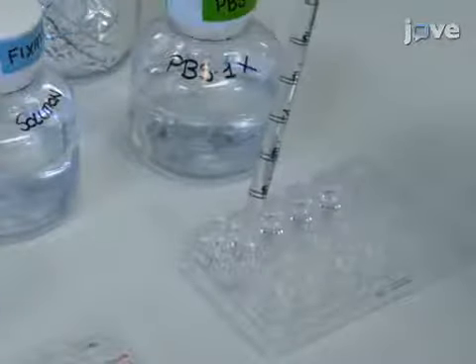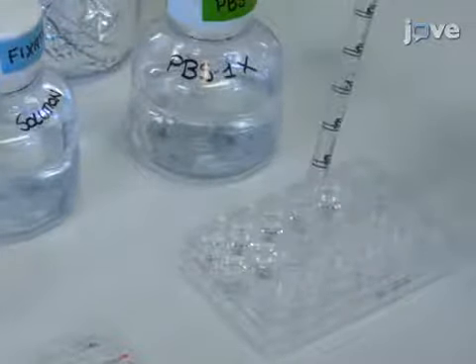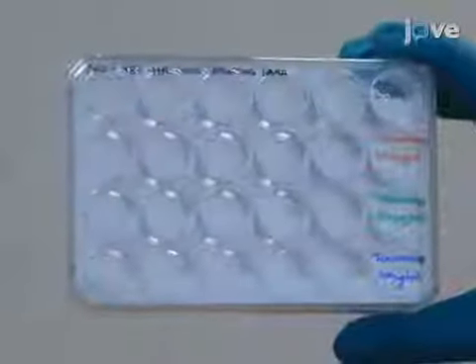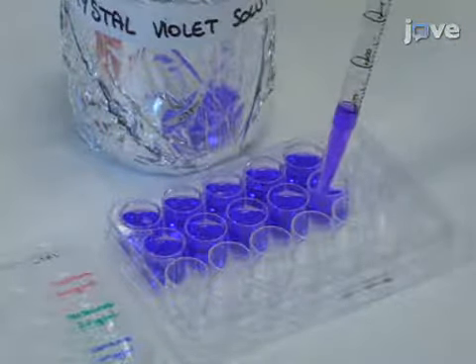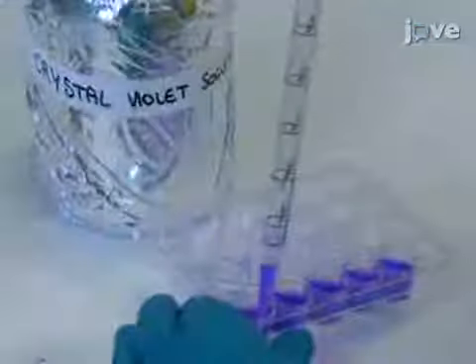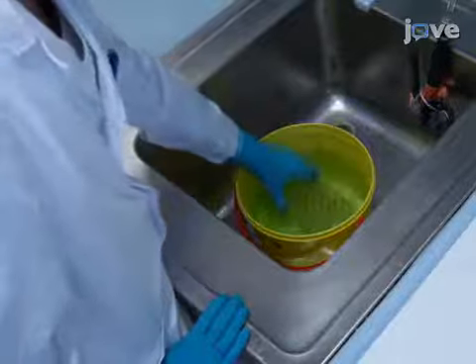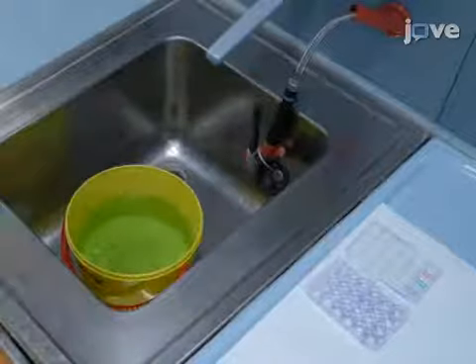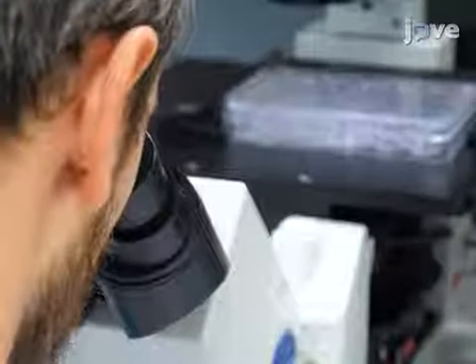Remove the medium and rinse the cells with 10 milliliters of PBS 1X. After removing the PBS, add 2 to 3 milliliters of fixation solution. Then, remove the fixation solution and add 0.5% crystal violet solution. Incubate at room temperature for 2 hours. Using a pipette, carefully aspirate the crystal violet solution. Next, immerse the plates in tap water. Air dry at room temperature for up to 2 days. After this, use an inverted microscope at 4x magnification to count the colonies containing more than 50 cells.